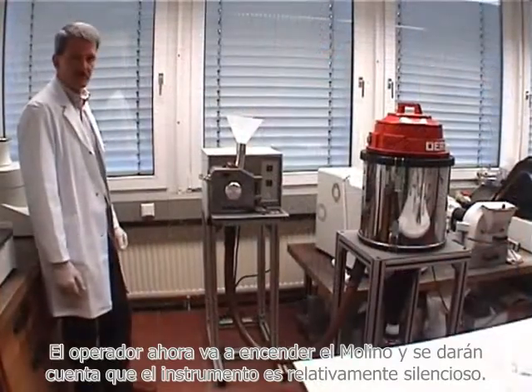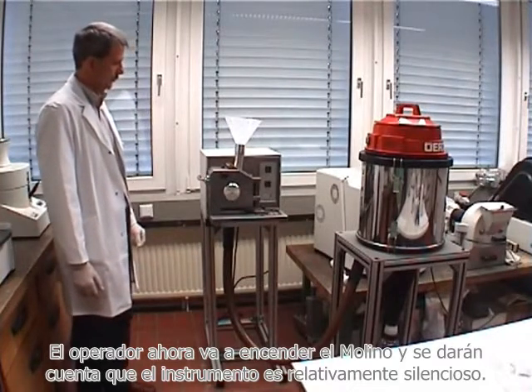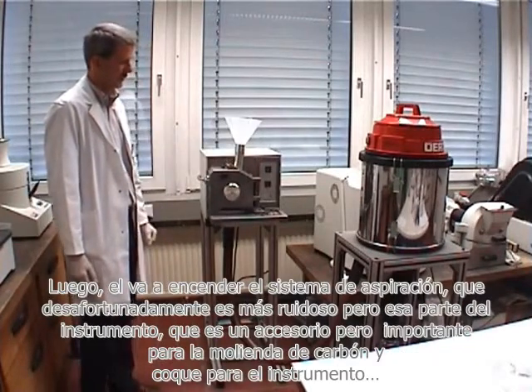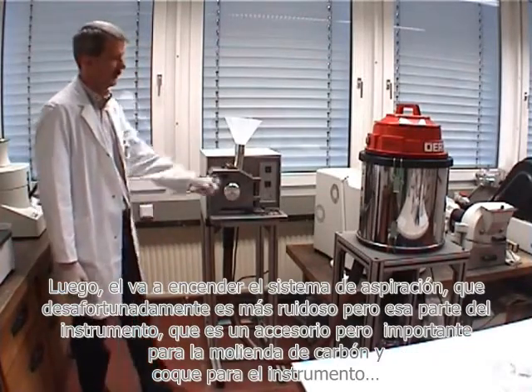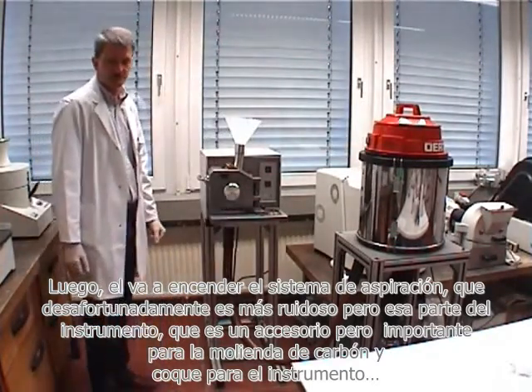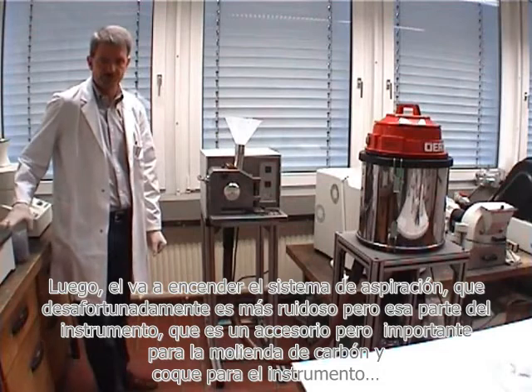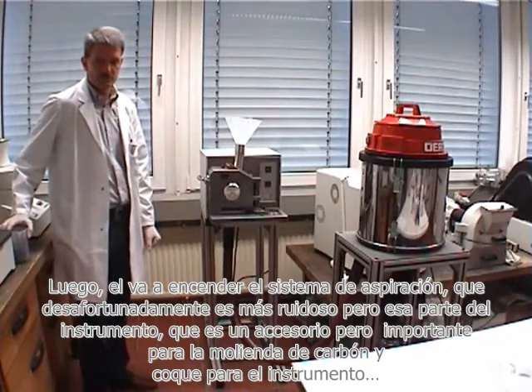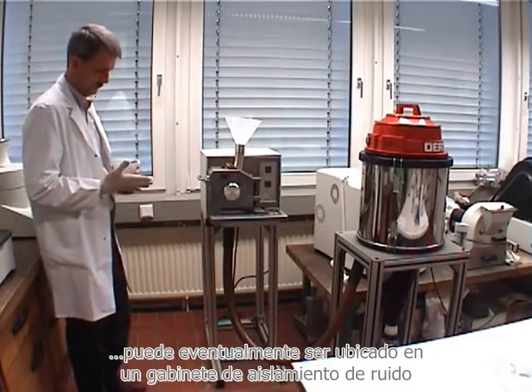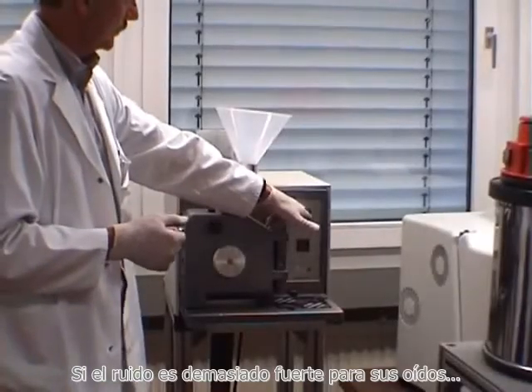The operator is now going to switch on the mill and you will realize that the instrument itself is relatively quiet. Later on he is going to switch on the vacuum exhaust system, which unfortunately is more noisy. That part of the instrument, which is an accessory but required for the milling of coal and coke, can eventually be put in a noise isolation cabinet if the noise is too strong.